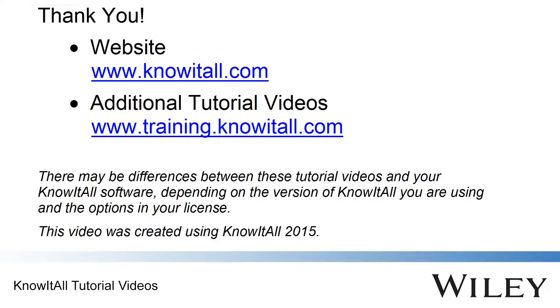This concludes our brief tour of Know-It-All ID Expert. For more information, please visit www.knowitall.com.